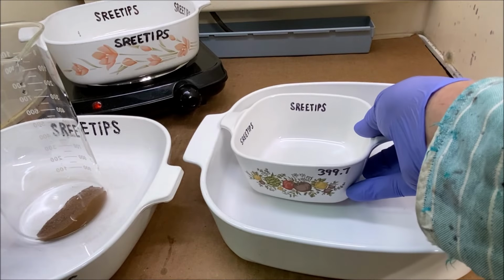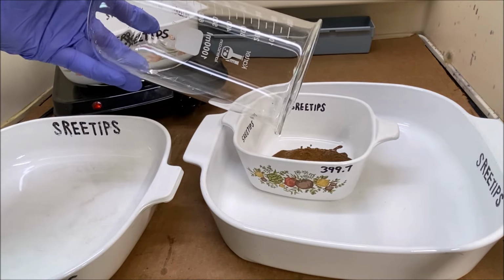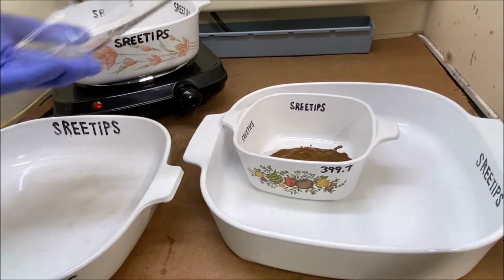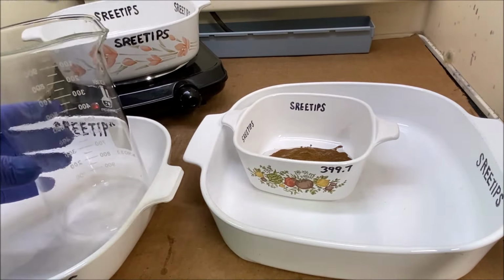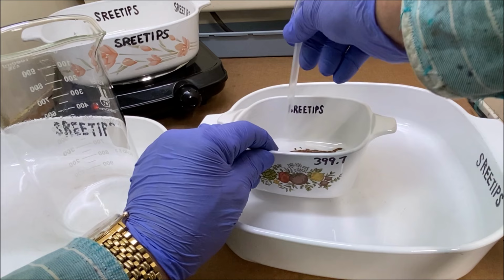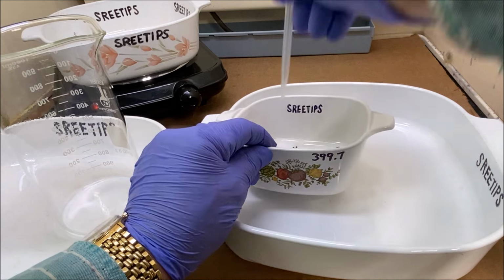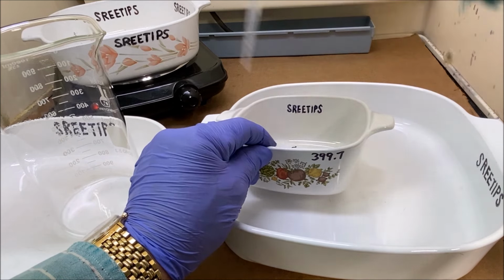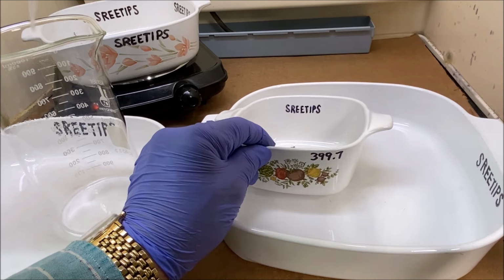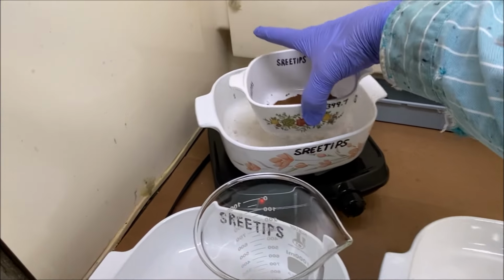Now let's transfer the clean gold into a clean dish here. It's just a Pyrex dish. And we're going to dry this out so that we can get a weight on it. Get some of that water out of there. This up on the heat and start drying it out.